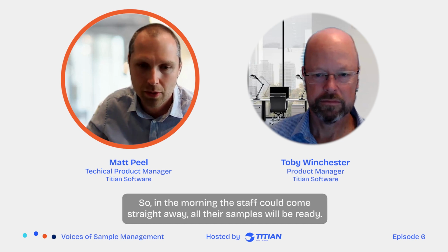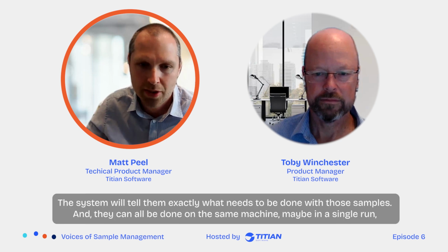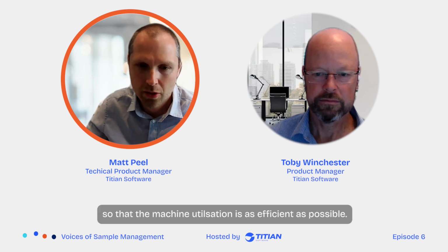And yeah, if you're using an automated store, that could be done overnight. So in the morning, the staff could come straight away, all their samples will be ready. The system will tell them exactly what needs to be done with those samples, and they can all be done on the same machine, maybe in a single run, so that the machine utilization is as efficient as possible.